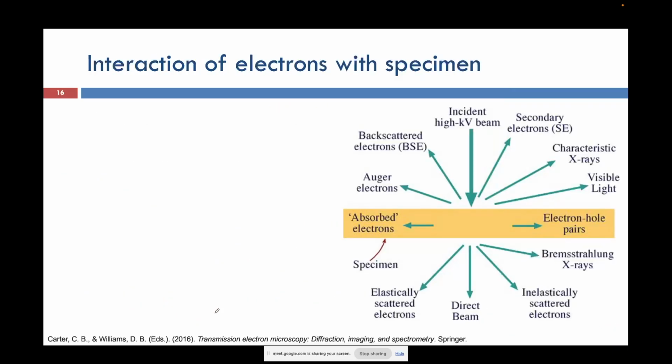Okay, and now, after coming all the way through the electron column in the scanning electron microscope, the electron hits the sample. Always remember, once the electron hits the sample, all kinds of rays will be generated. It is not that we will only get secondary electrons or only X-rays. I am considering a thin specimen here, because otherwise the beam cannot penetrate, and since the beam is penetrating here, I am considering a thin specimen.